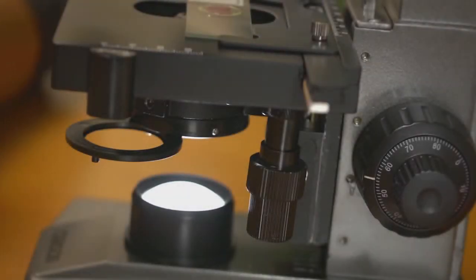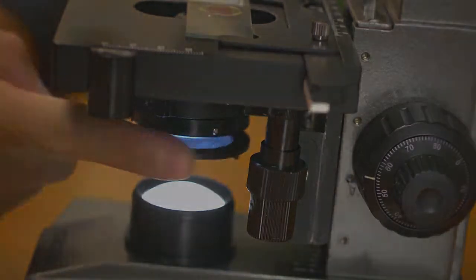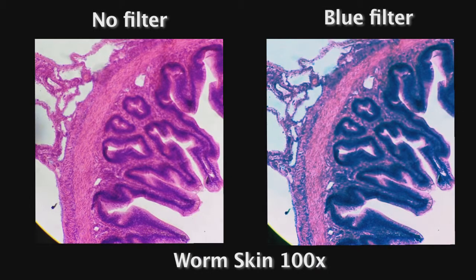Another feature that can really come in handy is the built-in filter holder. You now have the ability to place different color filters over your light source, which can sometimes make it easier to see the contrast in a specimen. These are standard size filters and we've included a blue filter to give you an idea of how it works.